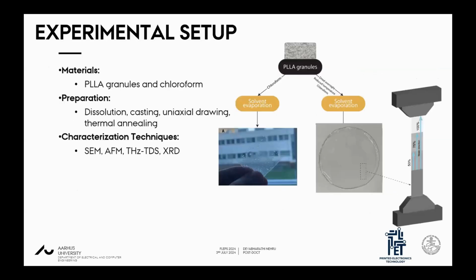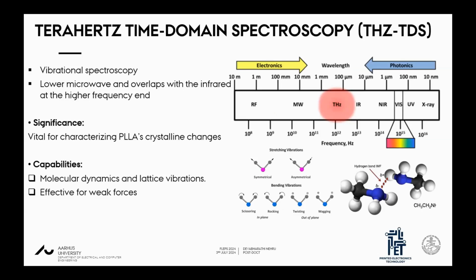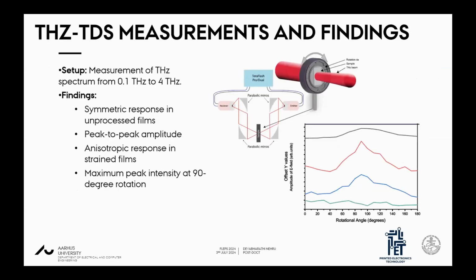So basically, the small cut portion of this material has been strained to 50%, 75% and 100%, and it has been taken for the THz spectroscopy study. First, we put our film in the setup in this way, and we also varied the rotation angle of the setup. The beam is sent perpendicular to the film, and we characterize the film with respect to different angles from 0 to 180 degrees.